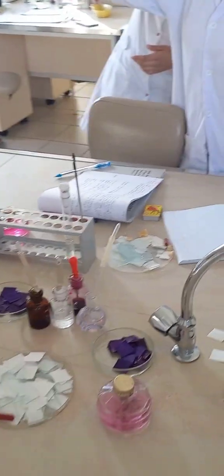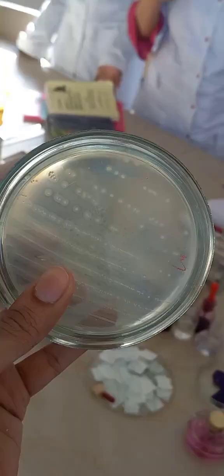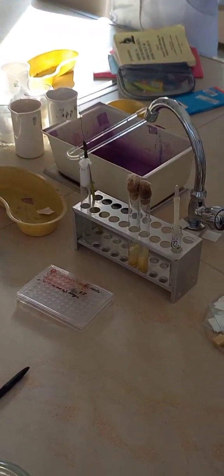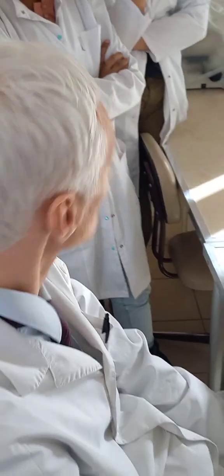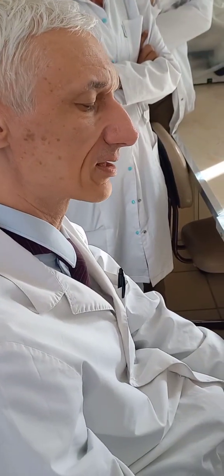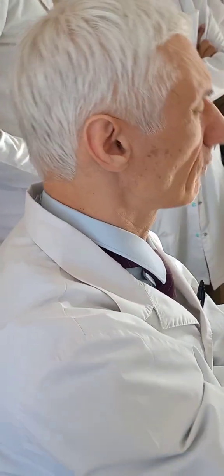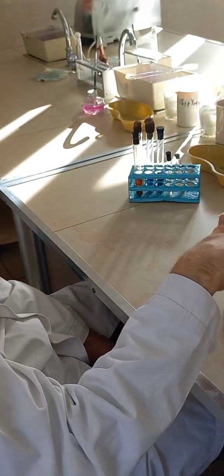So I think something like cholesterol may be settled down and so on. By the way, people, you know that if we find some biochemical feature, totally essential, totally typical, for a certain microbe, this is the best characteristic to discriminate between closely related bacteria. Well done. So I must comment, E. coli doesn't produce lecitinase at all. Moreover, honestly spoken, it cannot grow in egg yolk salt agar at all, because of the very high concentration of sodium chloride. So that's why we cannot check, but it doesn't produce lecitinase activity.